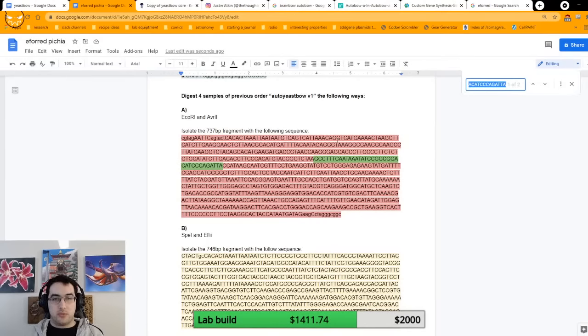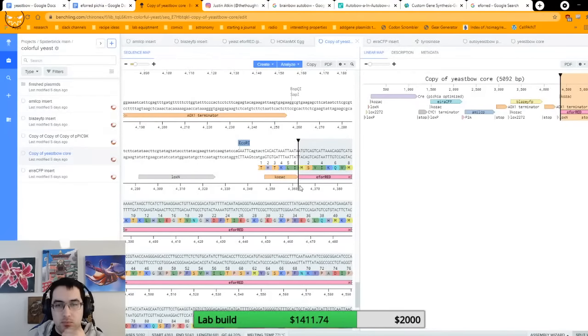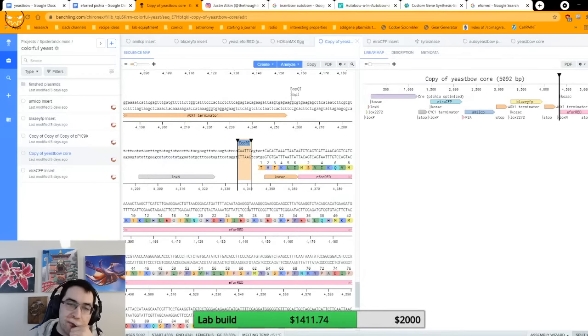That was more than a little concerning. What the hell? Maybe I copied wrong? AATC. What did I copy incorrectly? G. TTC. Oh, I didn't copy the G. But still, that shouldn't affect anything.